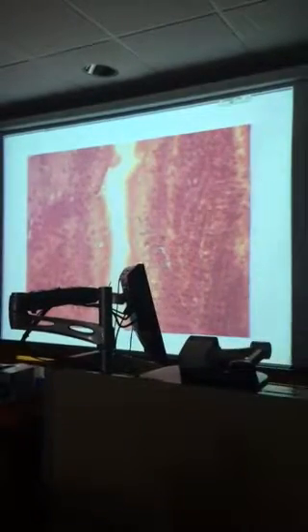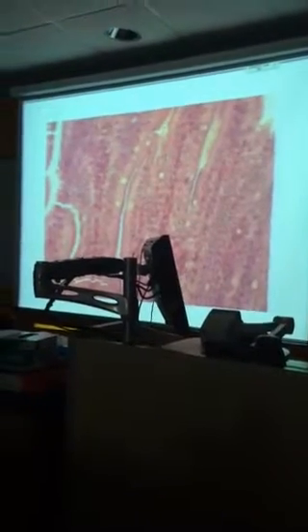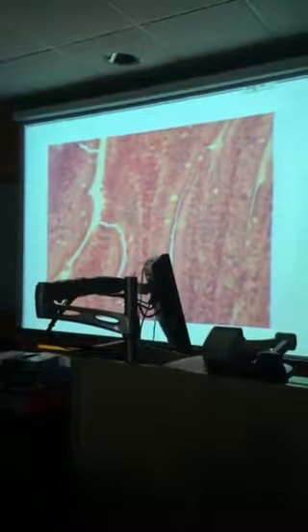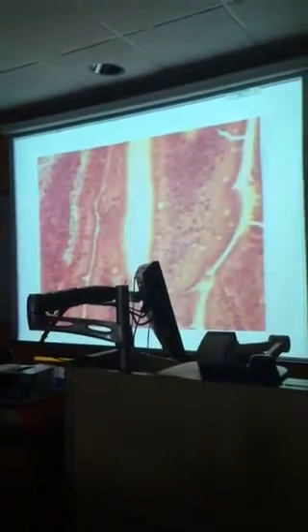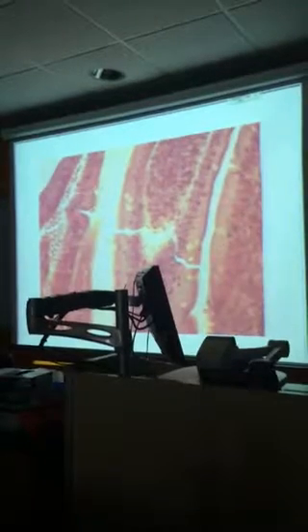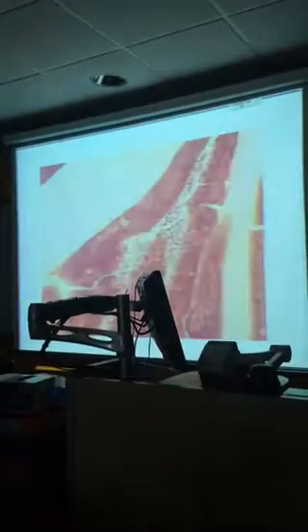And these are goblet cells, okay? And again, what do they do? They secrete mucus. That's all they do. They secrete mucus. They do not move the food, okay? I got some answers about that. They move the food. Or no, I got answers about they filter. They don't filter, okay? They provide the sticky mucus in the respiratory tract, which is part of the filtration system. But anyway, they're producing mucus. And again, they're in the epithelium, unicellular glands that secrete the mucus. Goblet cells. And then you can see more of the villi.